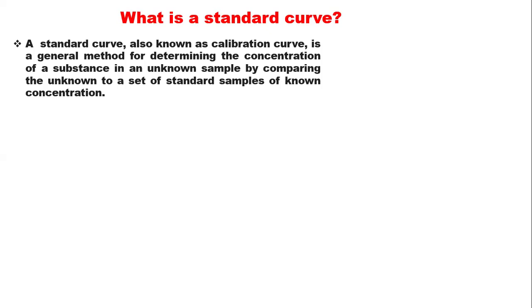So you vary the concentration of the standard sample so that you have different absorbances, so that you can now use them to plot your standard curve.